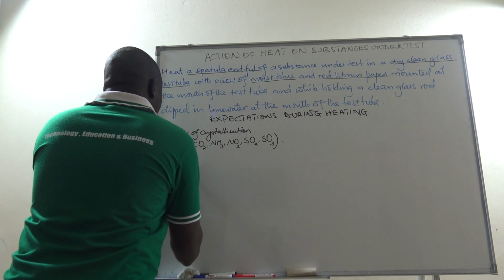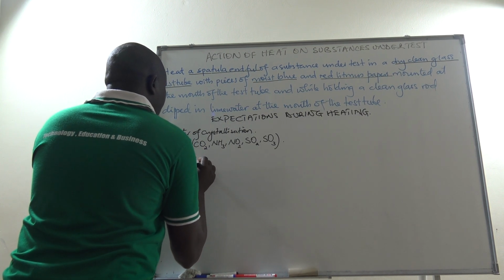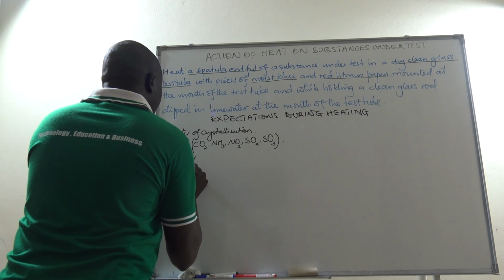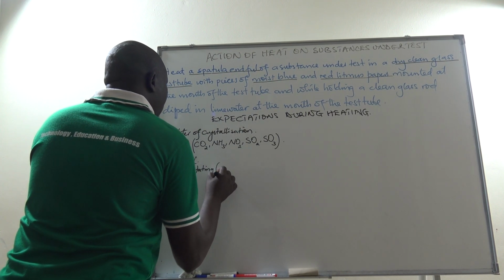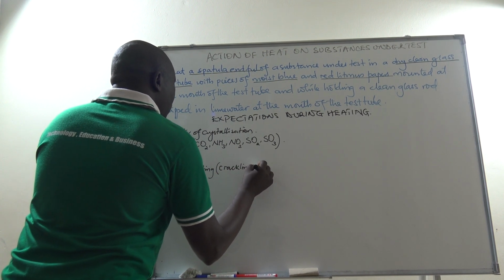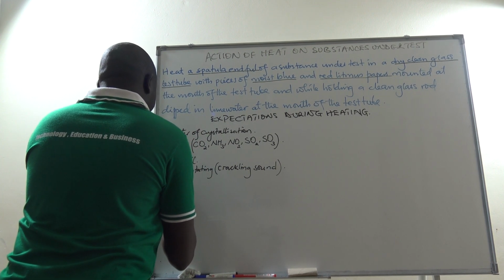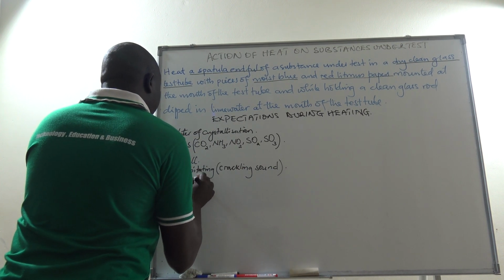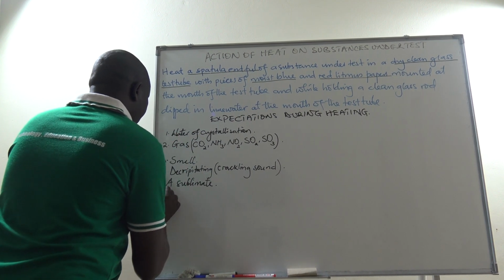Three, we expect a smell, if there is one. Not only that, we expect a decrepitating or what we call a crackling sound, and then we also expect to get a sublimate as well.